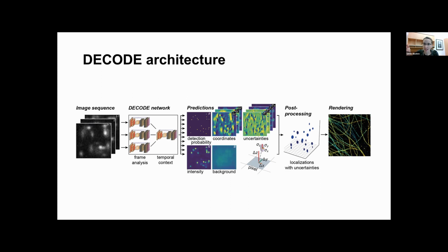That helps you to figure out how to treat different localizations within one image, because you have the temporal information. Maybe that is also familiar when you think about the grouping along the temporal space, which I mentioned at the beginning, that taking this into account can also increase your signal. Here it's along the same line.